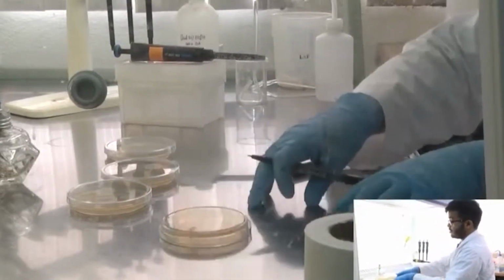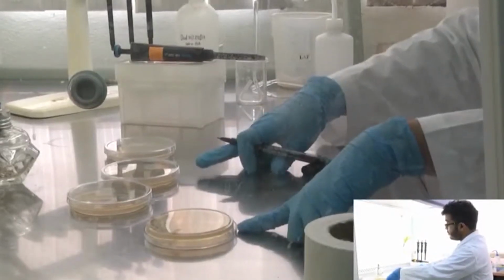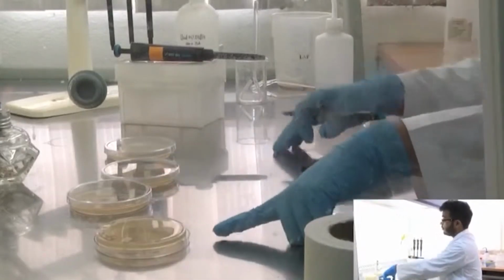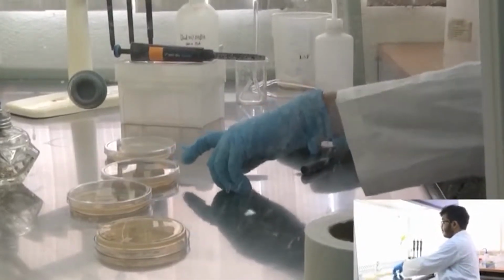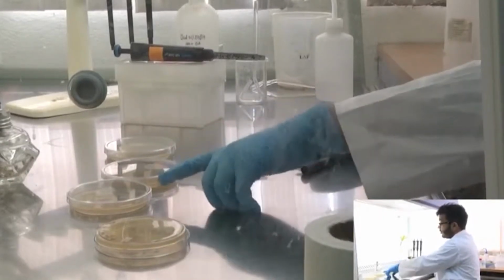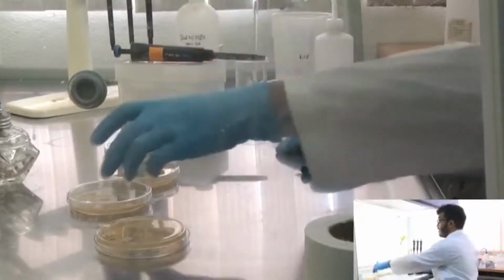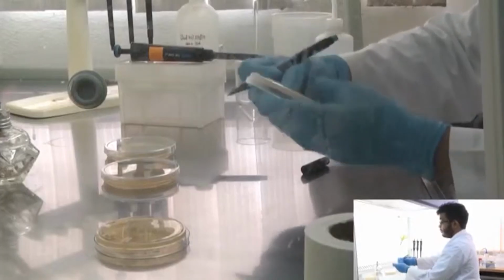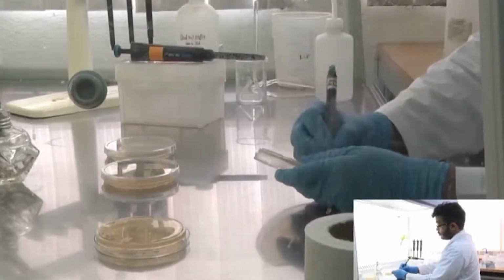in the inverted position. As I was mentioning earlier, when pouring the plates were in this position. Now that they have solidified and they have been labeled, we have to keep them in the inverted position, because you will notice already there is some condensation because of the heat that came out of the warm media. If we keep on storing it in this condition, after some time the water droplets will fall on the bed and that will create a mess. It's not good lab practice. It makes the media soggy, the surface soggy, and it should be avoided.